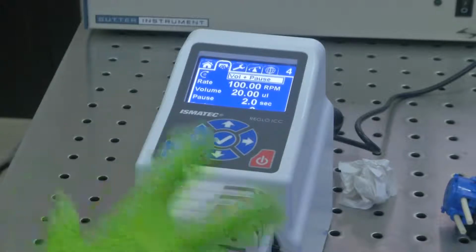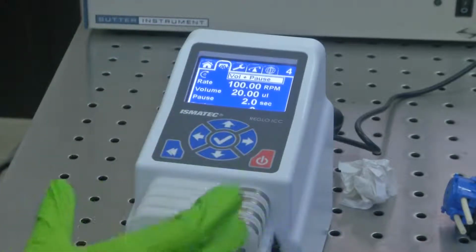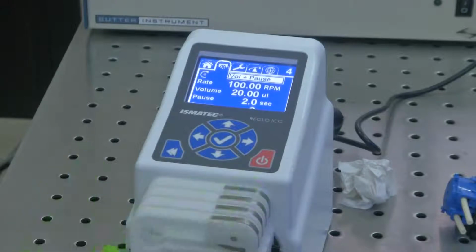So, these are the features through which you can work and then accurately, precisely control the amount of fluid flow through multiple channels across your device. So, this was the hands-on experience on the peristaltic pump.